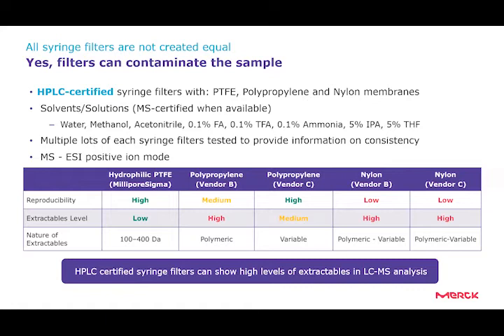And we looked at various solvents and solutions, mass spec certified whenever available. If you look at the table at the bottom, we gave a qualitative assessment to reproducibility. If you look at batch to batch reproducibility from one vendor to another vendor, we looked at the qualitative level of extractables as well as the nature of extractables.